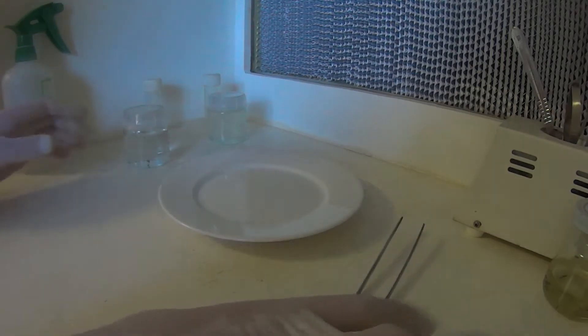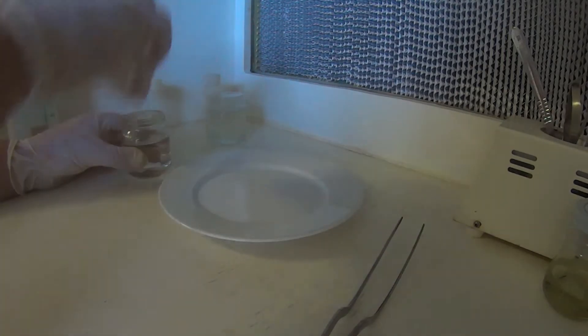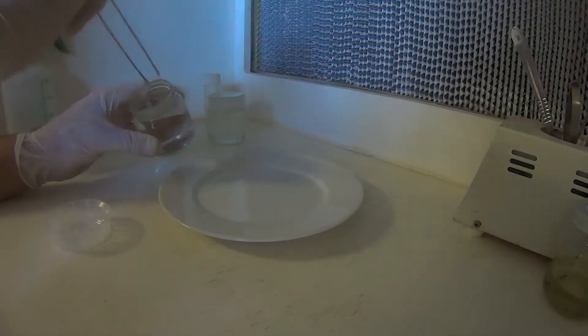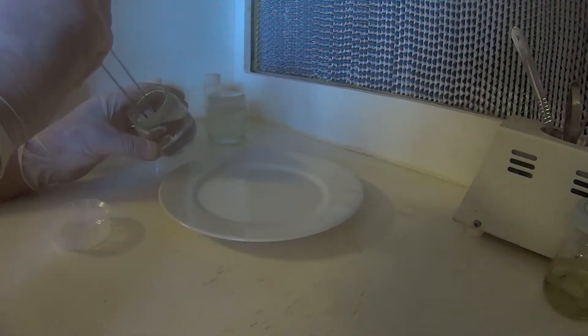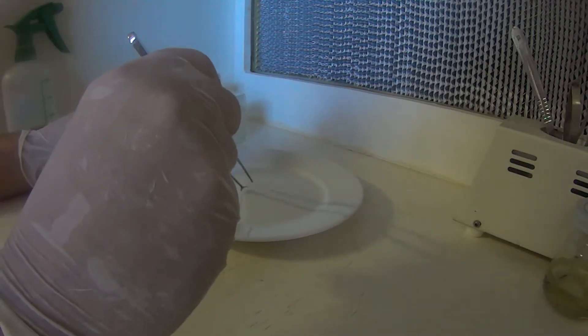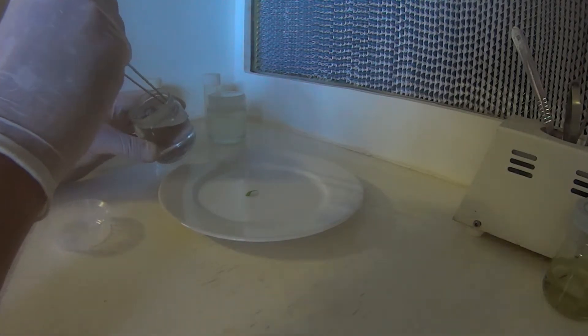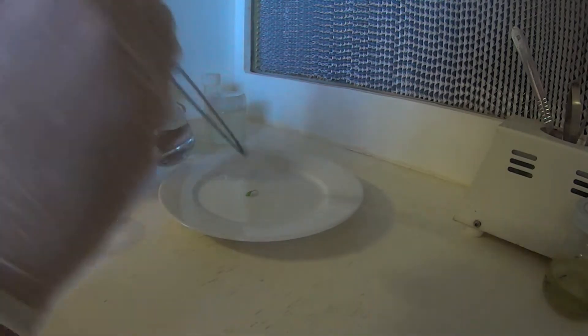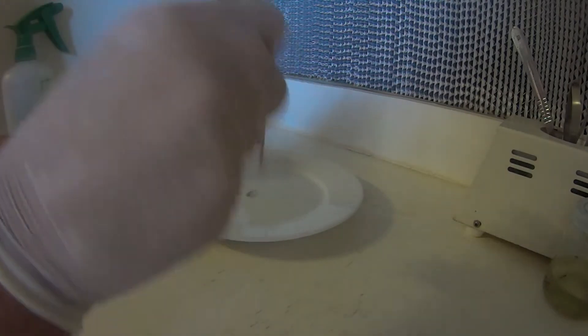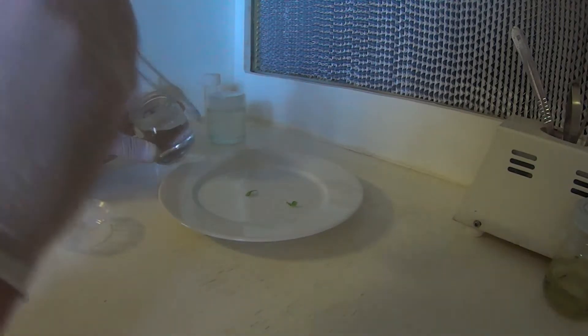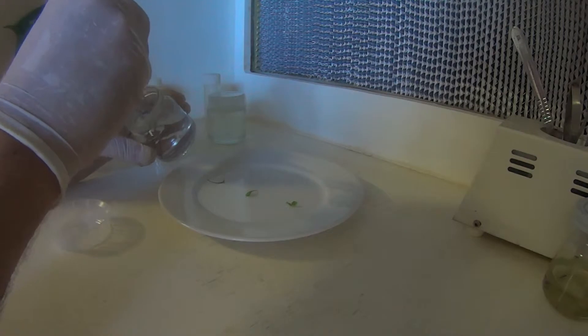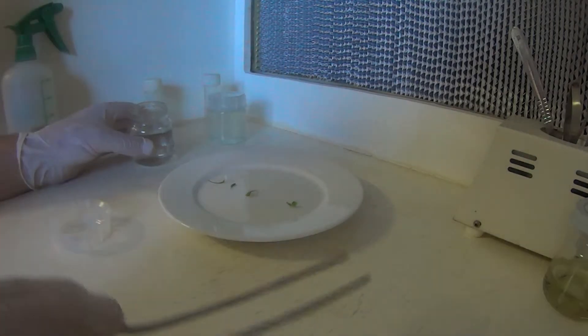All right, our Venus flytrap leaves have been rinsed in sterilized water now three times. So we'll remove them out. This is a sterile surface here on this plate as well. Try to get them out of here without squishing them.